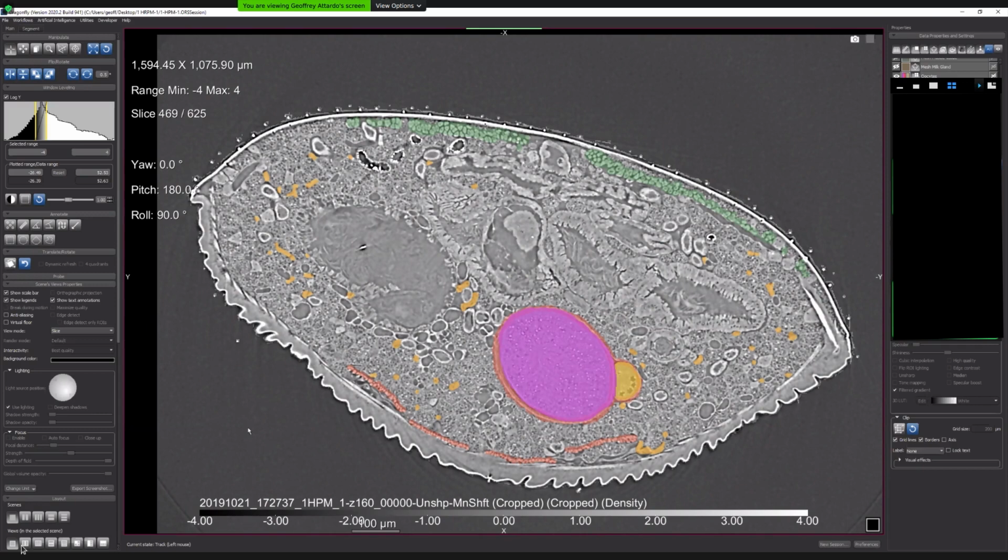Yeah, so I'll tell you what the outcome of that was. I did the deep learning, I trained up a model, and it actually got up to like 95% accuracy. Oh, that's pretty good. It could make predictions on unmasked parts of the training set with no problem.